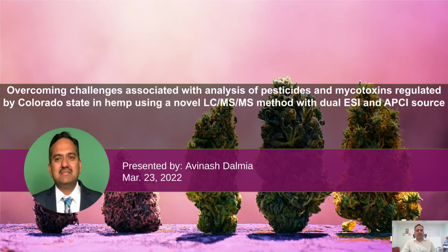This is Avinash Dalmia. I'm a senior principal application scientist at PerkinElmer. Today I will be presenting on overcoming challenges associated with analysis of pesticides and mycotoxins regulated by Colorado State in hemp using a novel LC-MS method with dual ESI and APCI ion source.